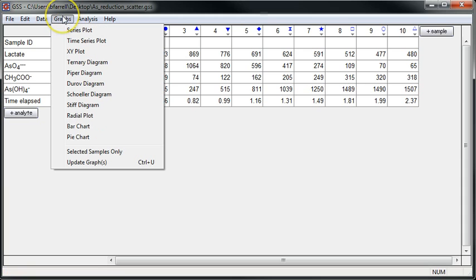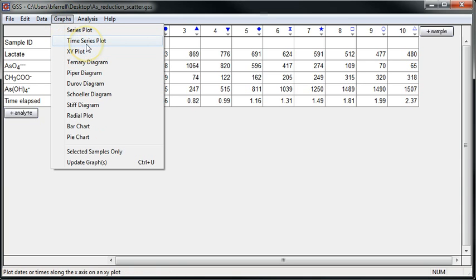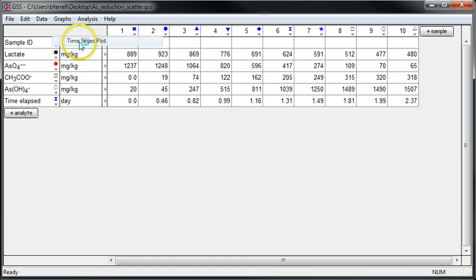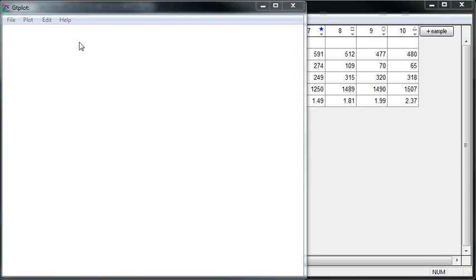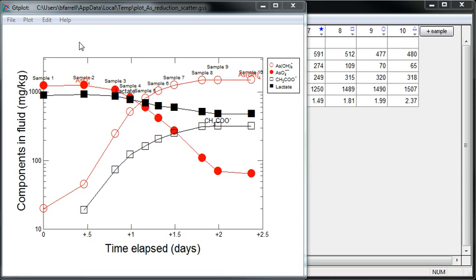Now I can move to graphs at the top and choose XY plot or time series plot in which time elapsed is one of the variables. This will launch GT plot.